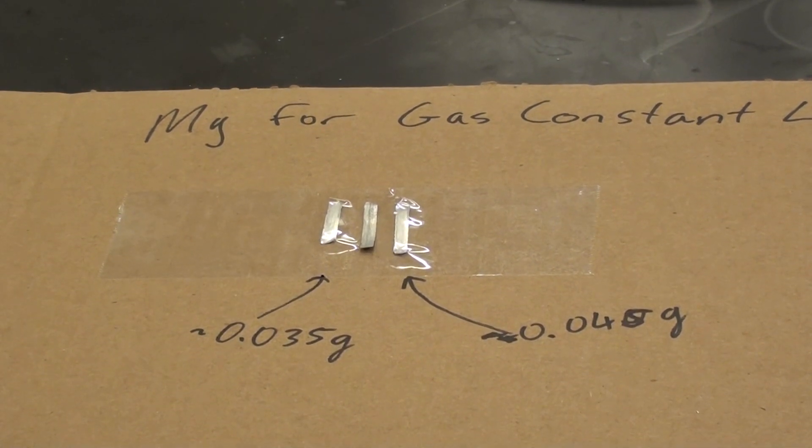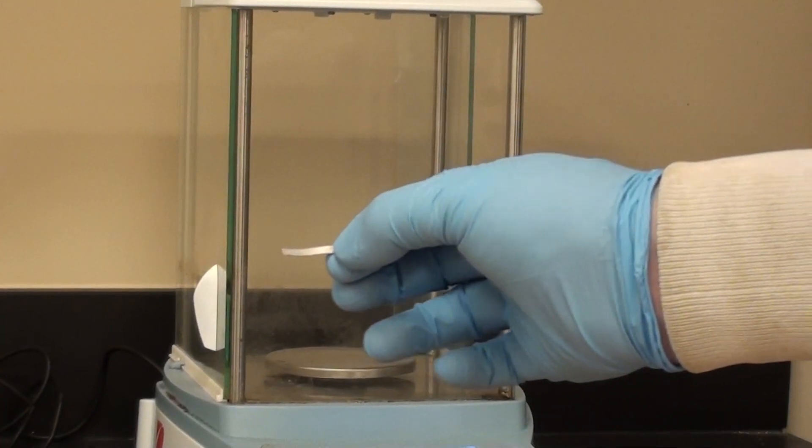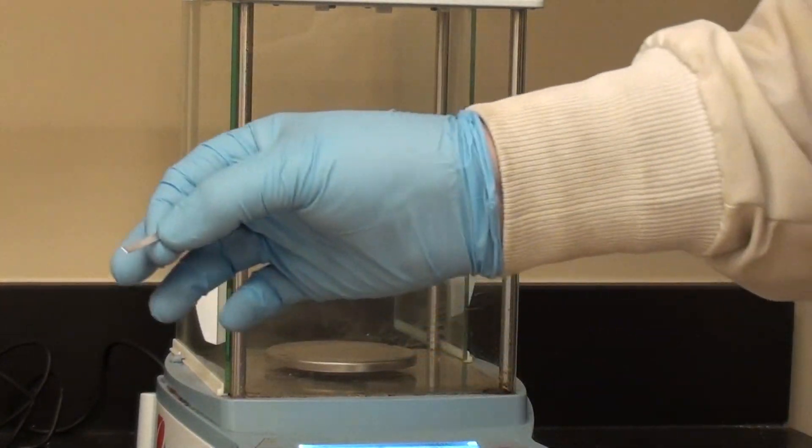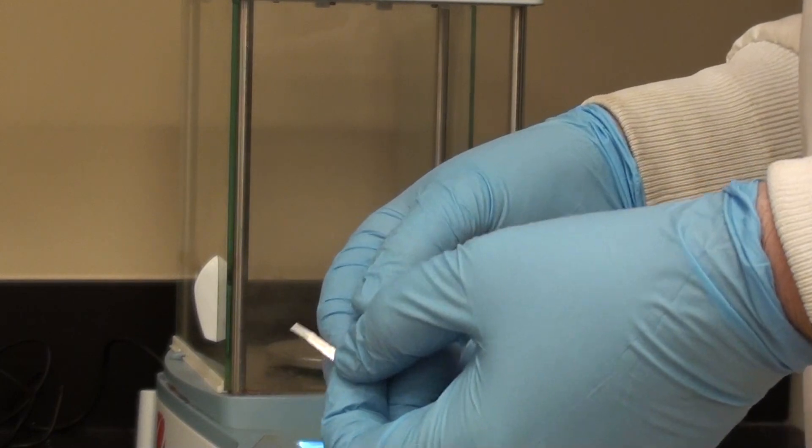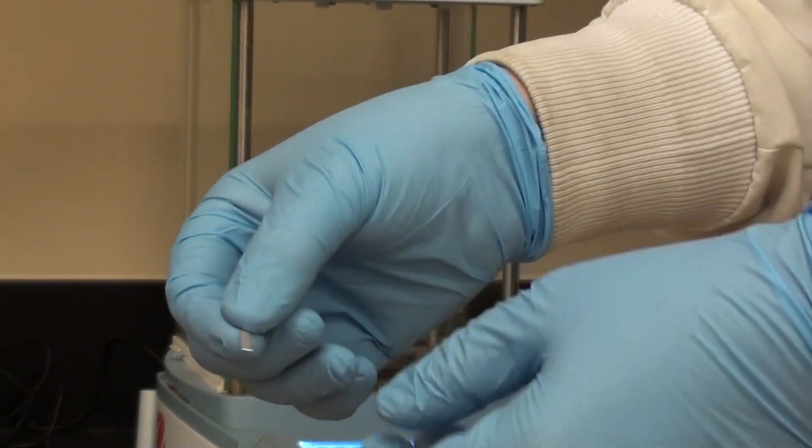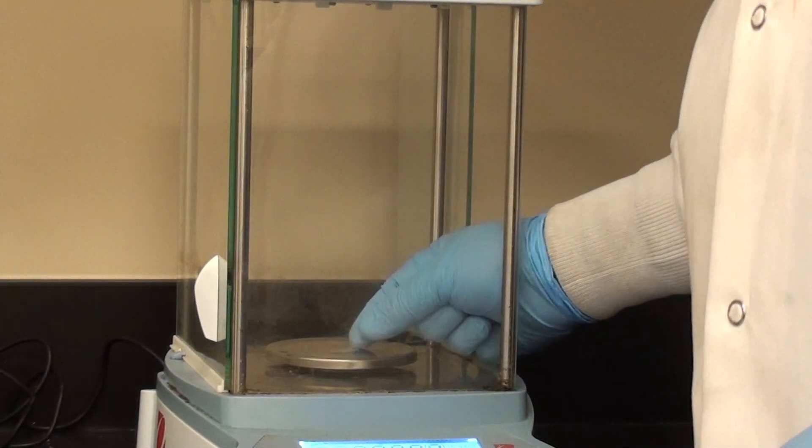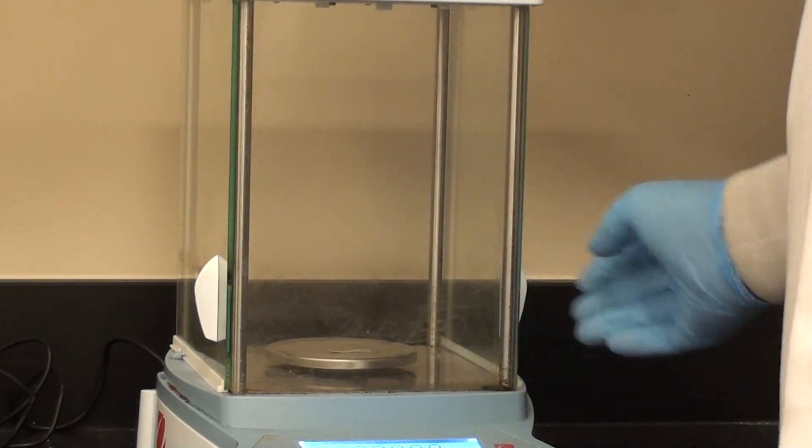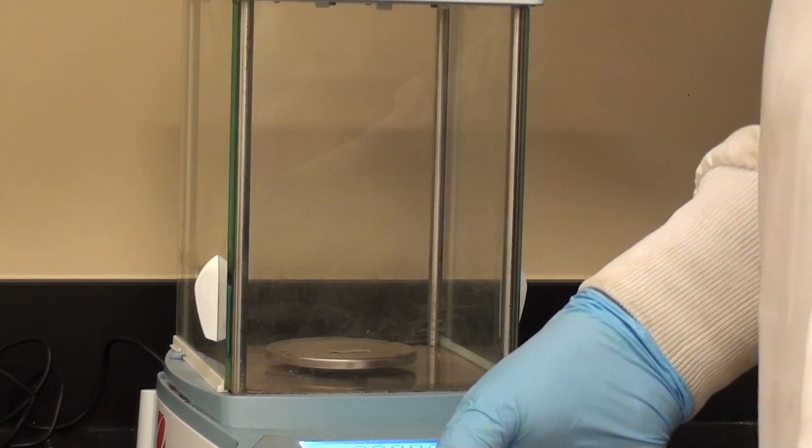So now we're going to take that and we're going to weigh it. Here's my cut piece of magnesium. It says in the directions it's probably a good idea to sand it as well before you weigh it. Then after you've sanded it you can put it on the balance and just note the mass. It should be somewhere between 0.035 grams and 0.045 grams.